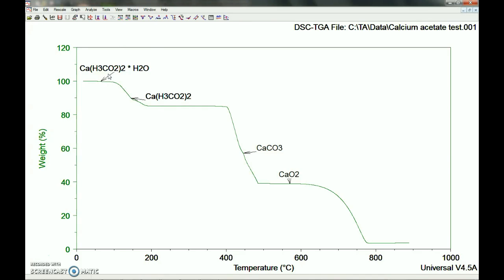So you'll notice that I made a couple annotations here of what these different peaks are. And I got those by figuring out the change in weight percent between these different parts here. You can figure out what each compound at each point should be. So the first one here happens at around 100 degrees Celsius. So that would indicate to us that it's water, and most substances are going to have that.